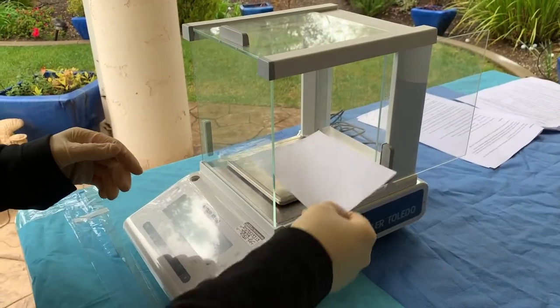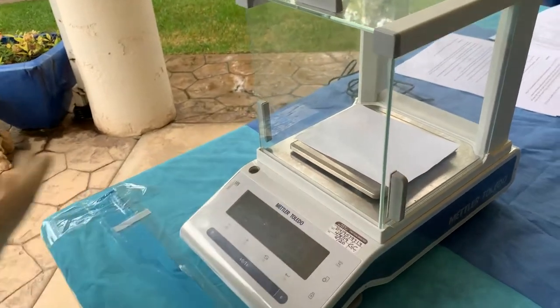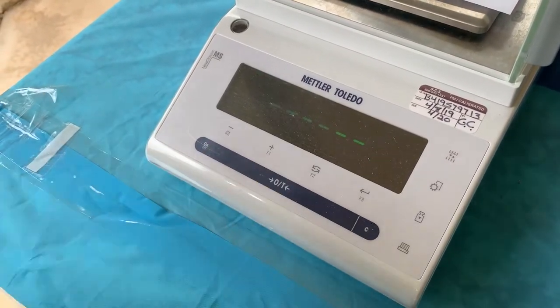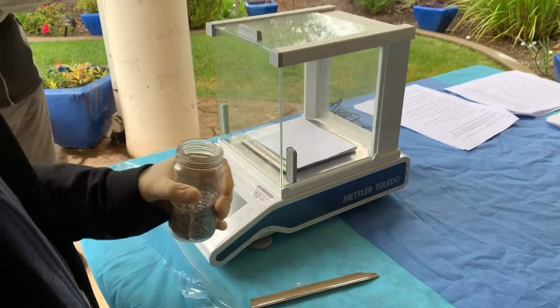Now we're going to place the weight paper inside the balance to zero it out. Then we're going to weigh out 1 gram of the magnesium onto the weight paper.